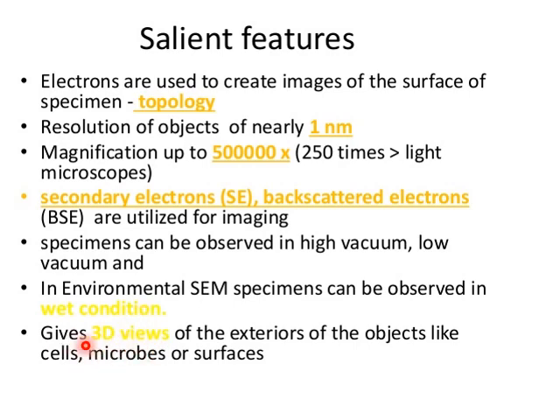Scanning electron microscope gives 3D views of the exteriors of objects like cells, microbes or surfaces of inorganic material. It gives a 3D view of the surfaces.